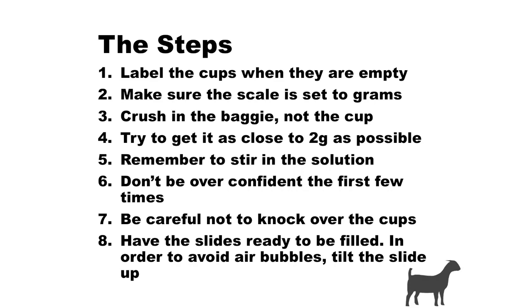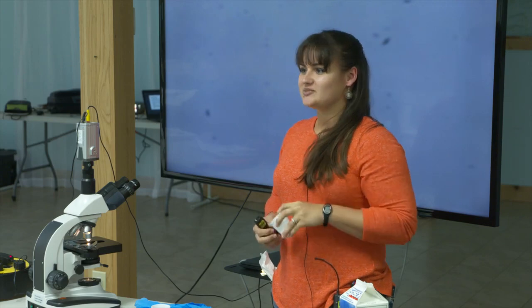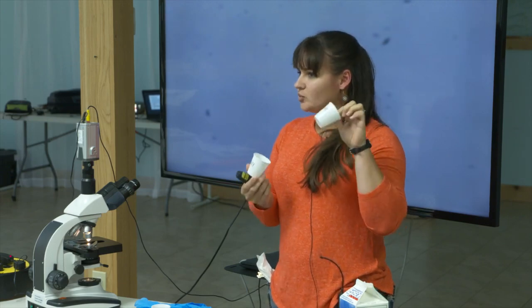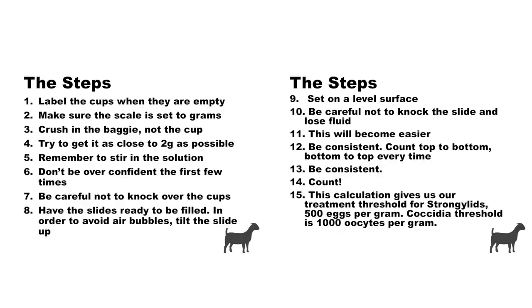Label your cups when they're empty. If you drink as much caffeine as I do, you're going to wear whatever is in this cup if you try to write on it when it's full — especially if you're doing more than one sample. So just go ahead and label both cups with the ID number and have them ready to go.